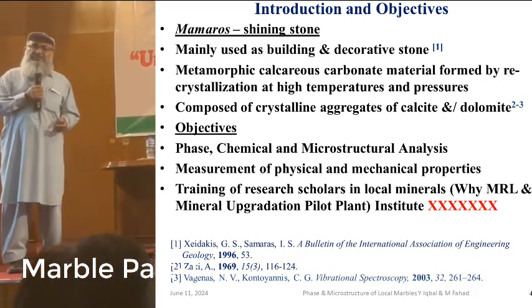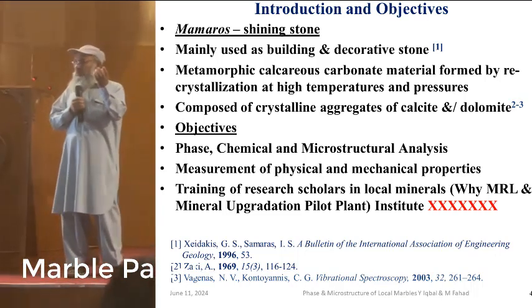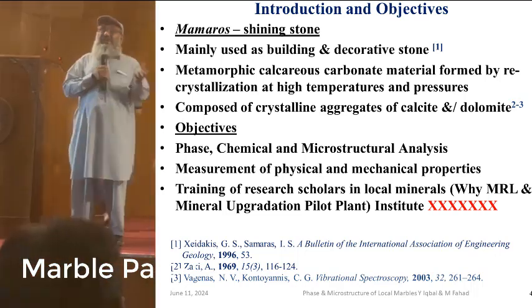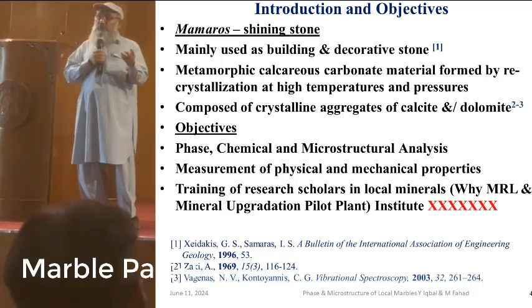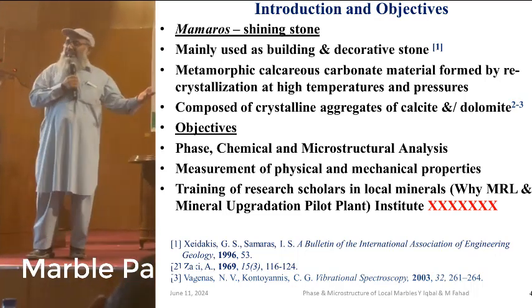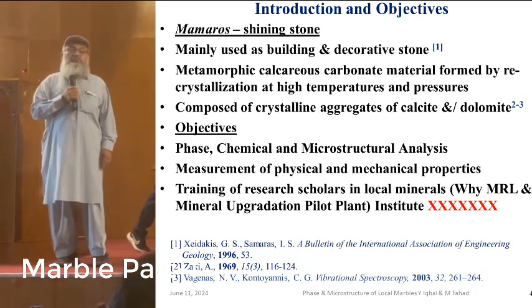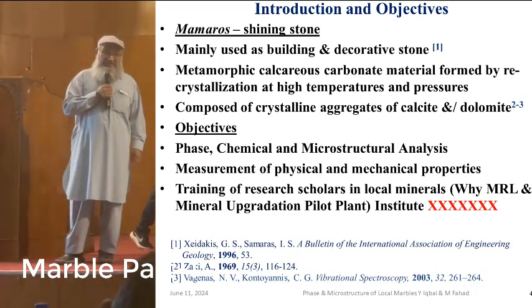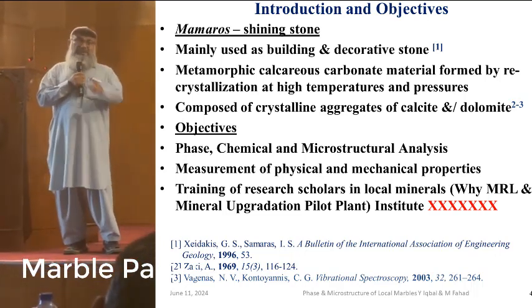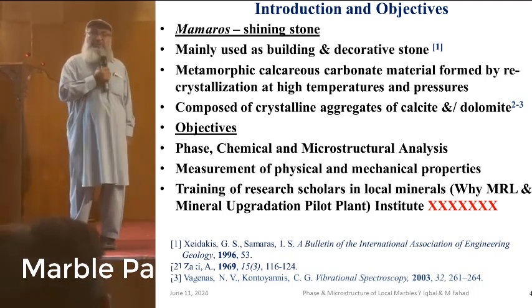What instigated me was that an Afghan businessman once came to me with a stone and told me that they were selling it for 2,000 rupees. A truck of that material was sold at 2,000 rupees. And when I checked it with scanning electron microscopy and energy dispersive spectroscopy, it was 68% chromite, which I think is one of the best resources of chromite in the lower mountains of Afghanistan. And that instigated me towards such a project.